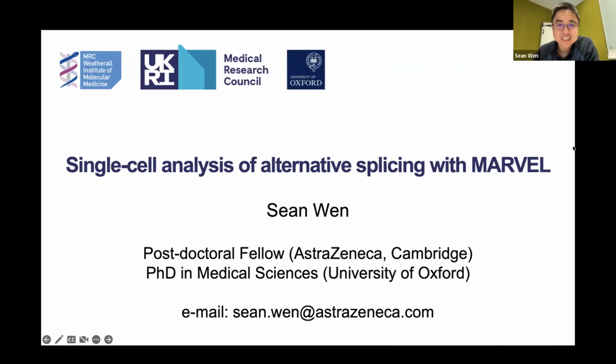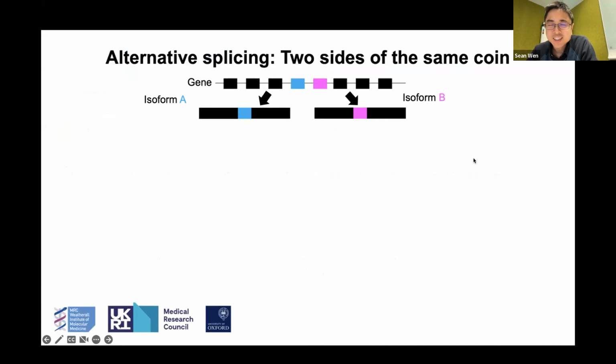I will get started. So the title of the talk today is single cell analysis of alternative splicing using a recently published software called Marvel. So what exactly is alternative splicing?